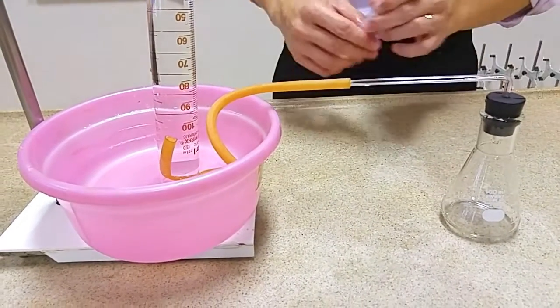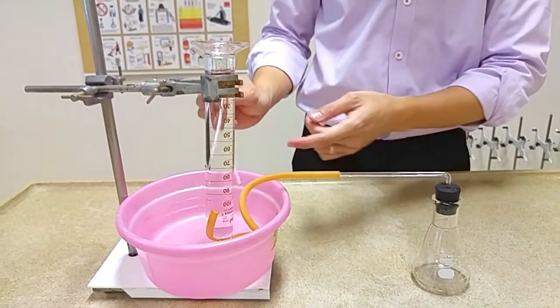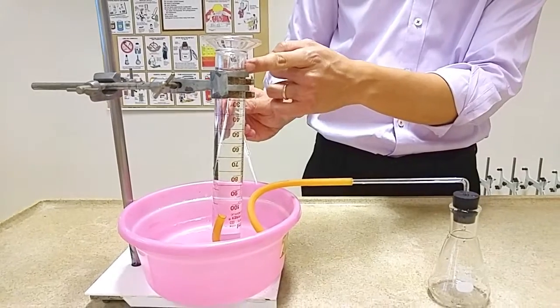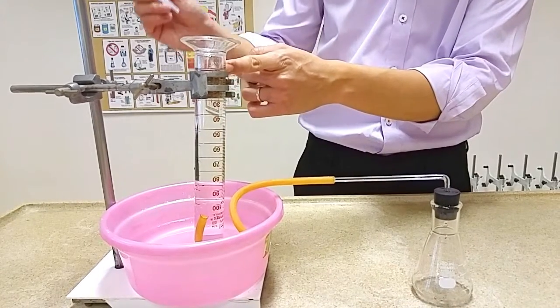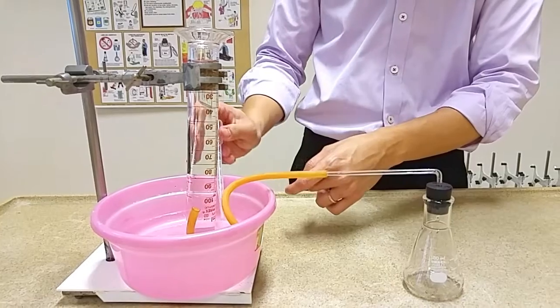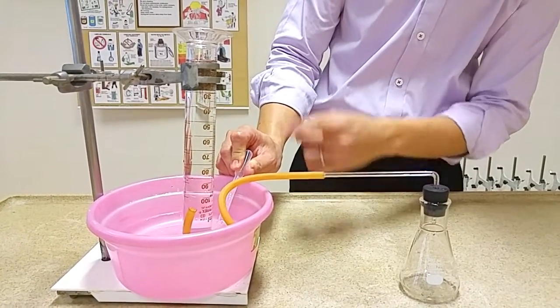Once this is done, use the dropper and insert air bubbles into the measuring cylinder such that you can adjust the water level to a convenient reading before you start your experiment. Squeeze the dropper in the basin of water to introduce air bubbles.